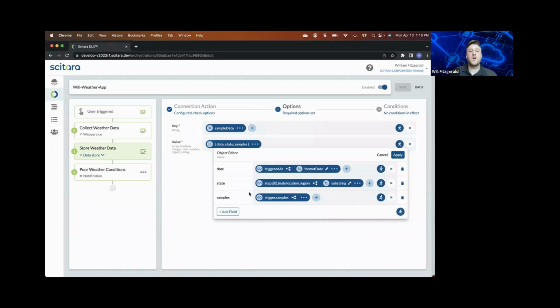Looking at a slightly more complex example, I've also included an array of samples within this orchestration. If I look at the output, you can see I have 10 samples. Each one has data such as a vial number, an injection volume, number of injections, and so on.